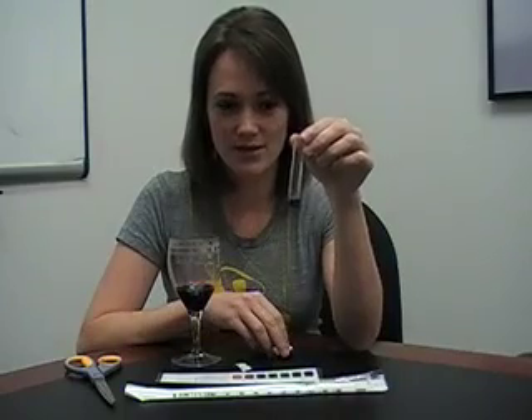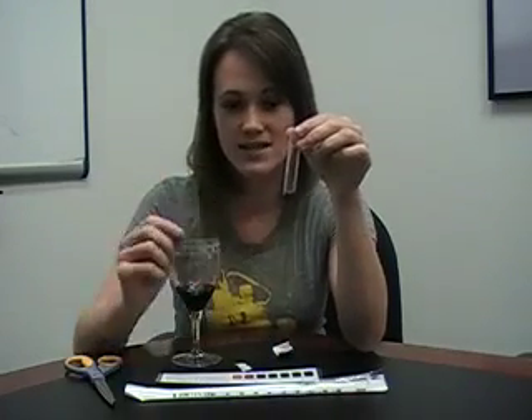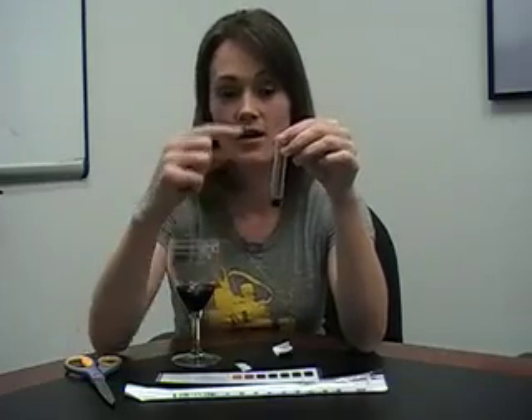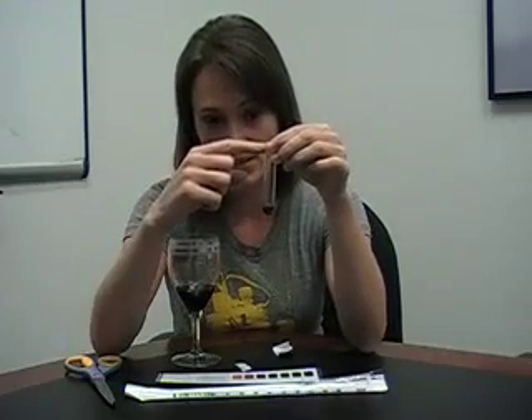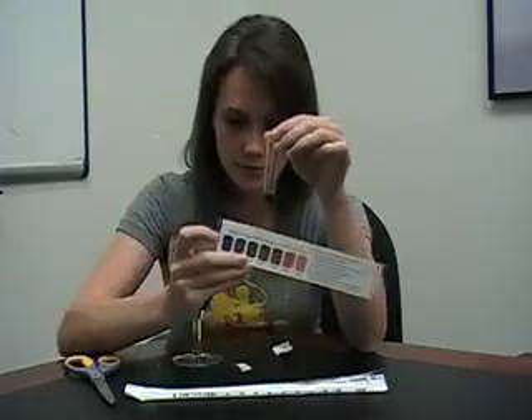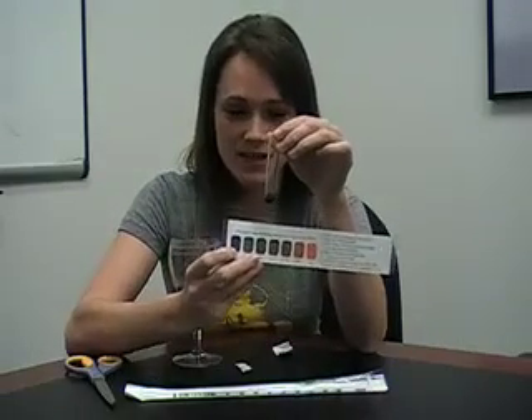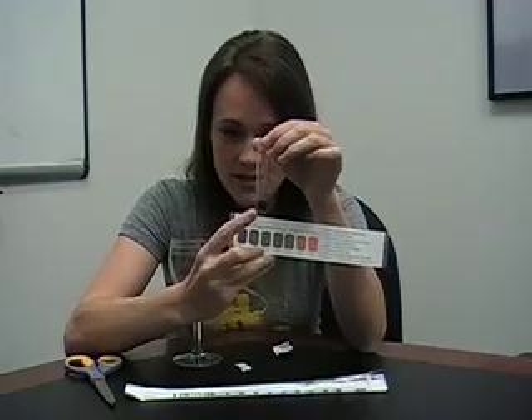Now we get to watch the fireworks as the sample boils. It's going to take just a little bit to get going, but once it does it's going to get really hot, so hold the test tube at the top. Also watch as it boils — it's going to go through this dark blue color. We want it to go through this dark blue color at the beginning of the color chart as it's boiling, which it is right now.